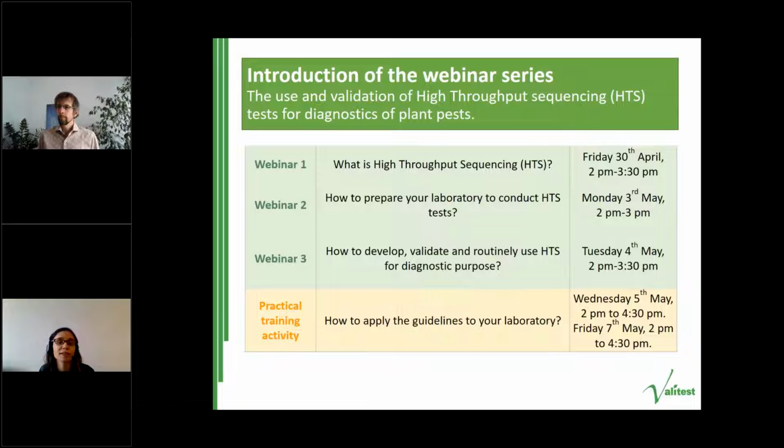Because of the growing interest in applying HTS for routine diagnostics in plant health laboratories, the objective of this webinar series is to present the recommendations developed by work package 2 of the VALITEST project on the process of selection, development, validation, and verification of high-throughput sequencing tests, and the quality assurance of their routine use as diagnostic tests. These recommendations are general to enable a broad application in all plant health fields, with appropriate flexibility to account for changes of technologies.